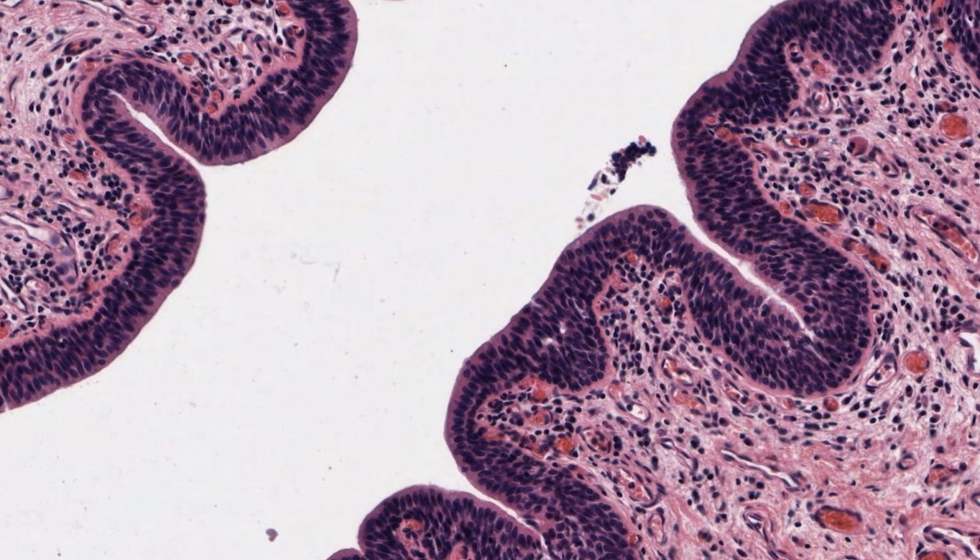These sheets of extracellular proteins and fibrils are so thin that they can be seen only with an electron microscope. Under many epithelia, additional carbohydrate-rich material is associated to the lower face of the basal lamina. If the accumulation is sufficient to be seen under the light microscope, as you can see here, it's called a basement membrane.